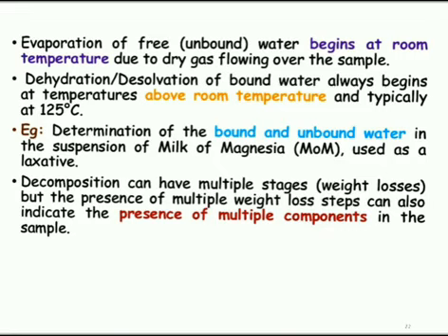So the TGA curve is also used to study the decomposition of the substance, the nature of the substance, and at what temperature it decomposes.